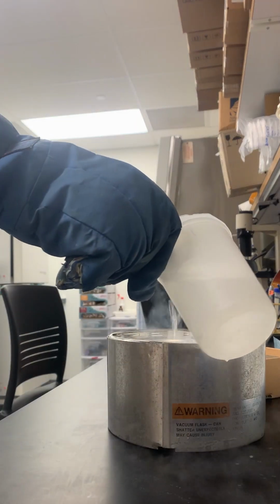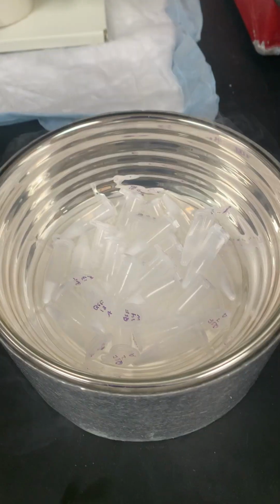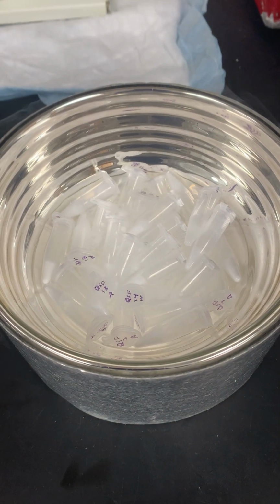Once all of the fractions have been collected from the last column, I freeze them in liquid nitrogen to make sure the purified protein doesn't degrade.